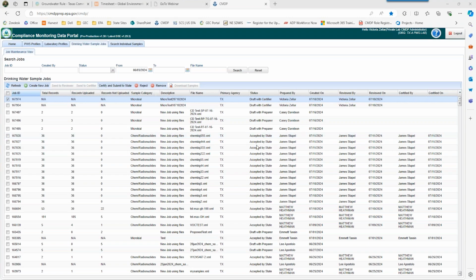Okay, can we populate the Excel file straight from our LIMS using the correct headers, etc., then submit? Casey or Victoria, do you want to answer that? Yeah, that's definitely a possibility. It takes a little bit more work. We're going to touch on that briefly in this presentation, but we're available for more one-on-one work on that if that's something that interests your lab. So we can meet further about that. Yep.